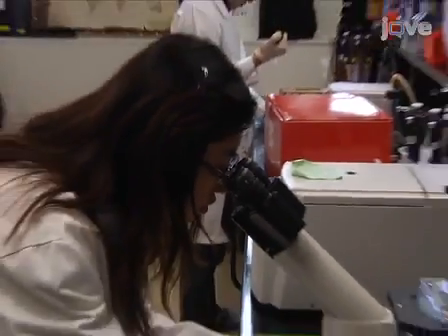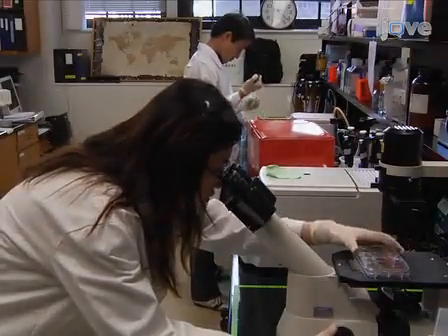After 2 days, examine the culture under a microscope to verify that the cells are growing in a closed monolayer for microinjection.